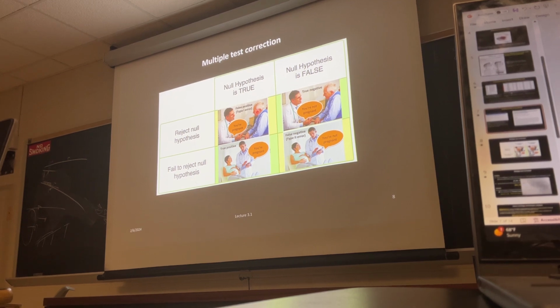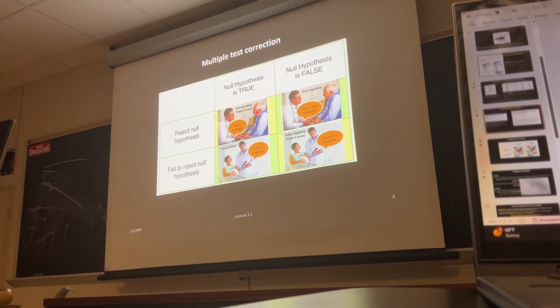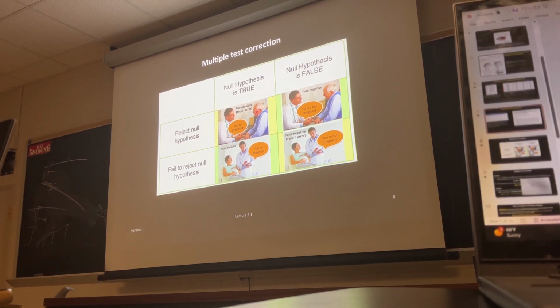It's a false positive result. You don't want to miss those obvious DEGs from your analysis, so you want to keep those. That's why DESeq2 offers false discovery rate correction for those initial p-values.